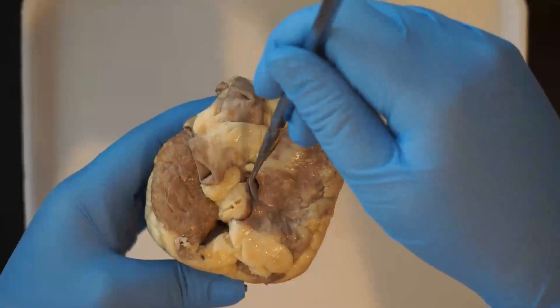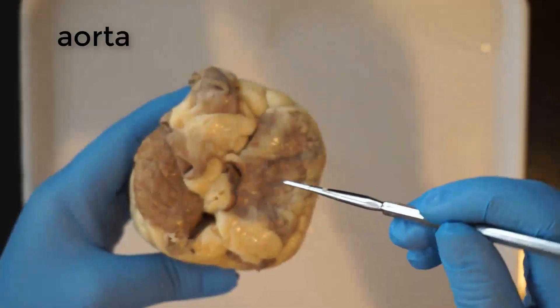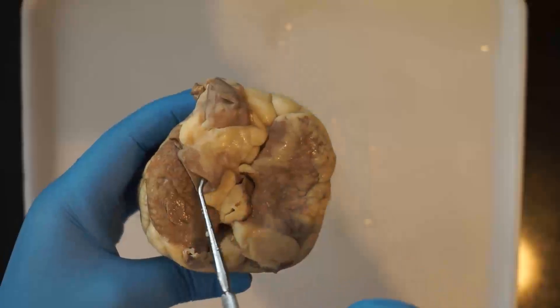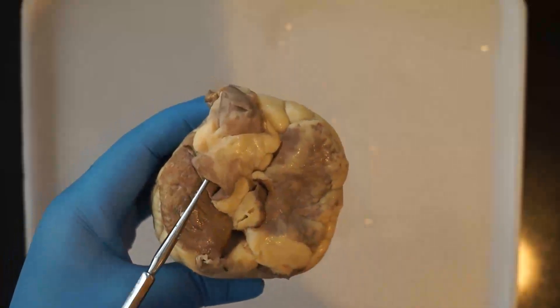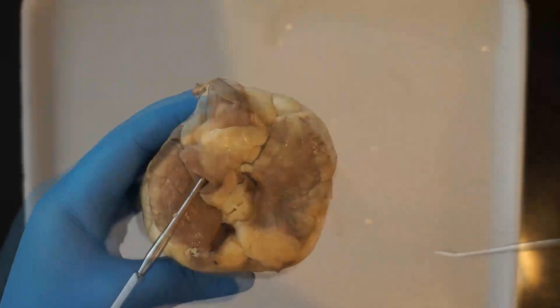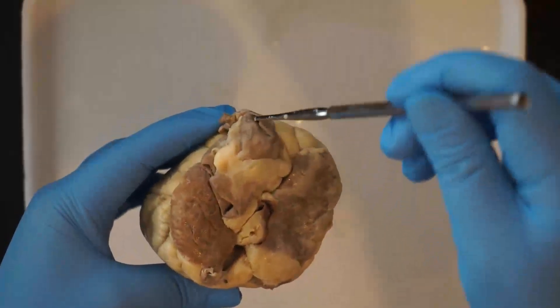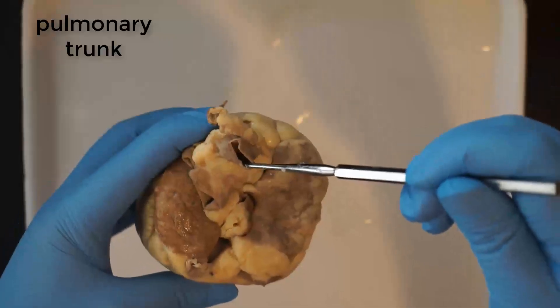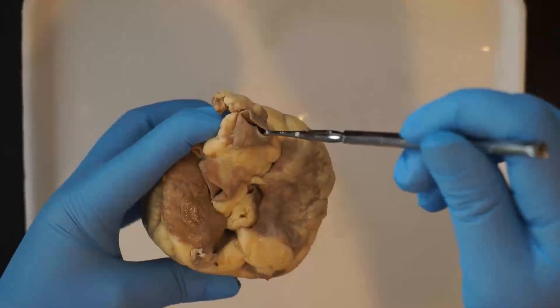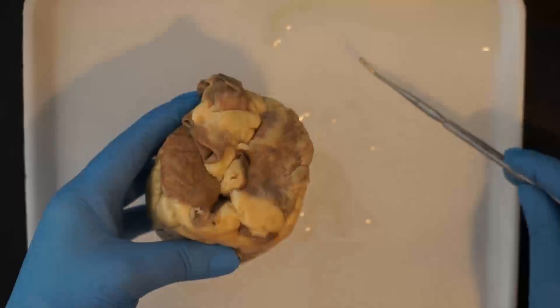Next you can find the aorta, which is the largest artery leaving the heart. That is carrying oxygenated blood away from the left ventricle out to the rest of your body. Then finally you can find the pulmonary trunk near the front, which is divided into the left and right pulmonary arteries. That carries deoxygenated blood away from the right ventricle to the lungs.